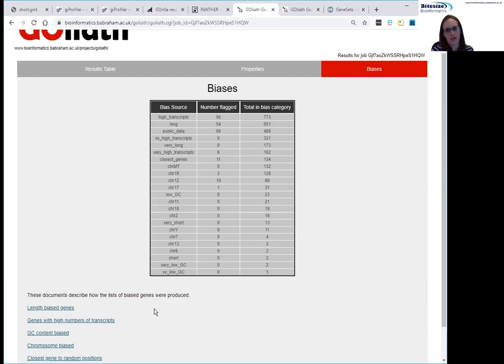So it's not saying that the category itself is bad at all, just that perhaps it seems to be more likely that this category will be identified when perhaps it shouldn't have been biologically. So it might just be that there are genes in that category that are easier to select for in our analysis, whether we mean to or not.